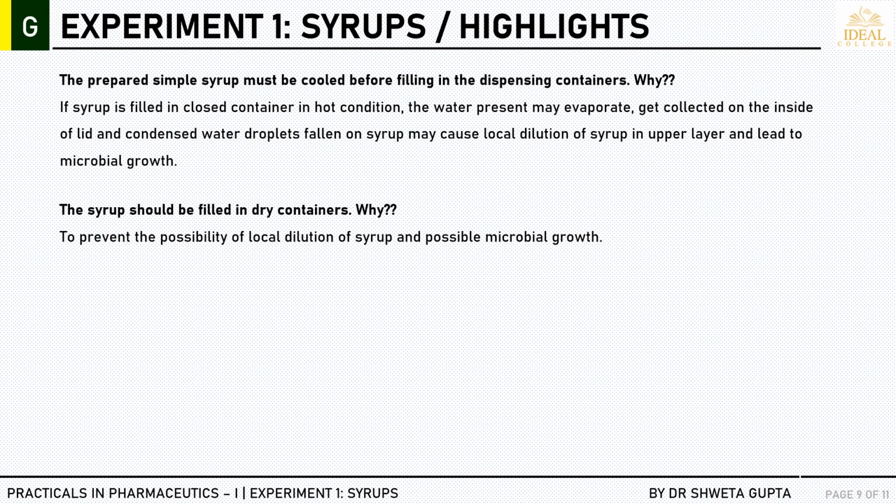The syrup should be filled in dry containers. Why? Because if they are filled in wet containers, the water droplets which will come in contact with the syrup can locally dilute the concentration, which may again lead to the possible growth of microorganisms.